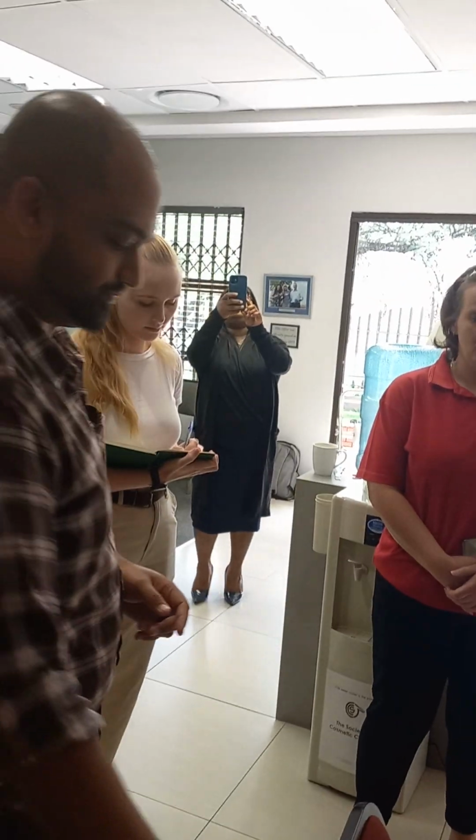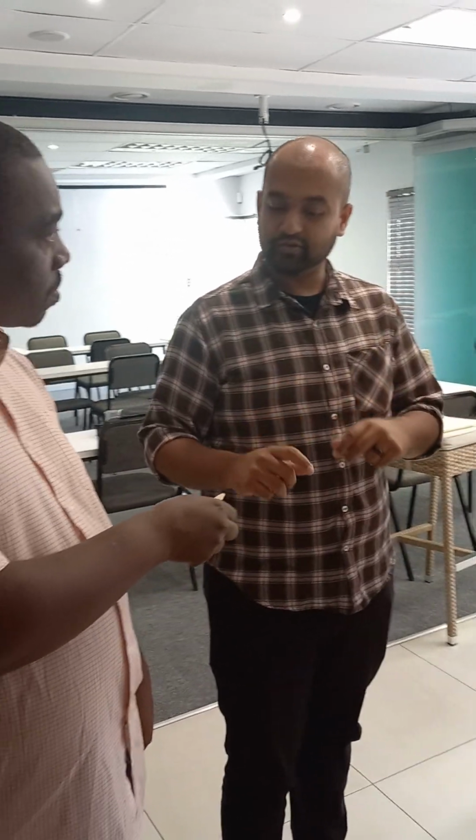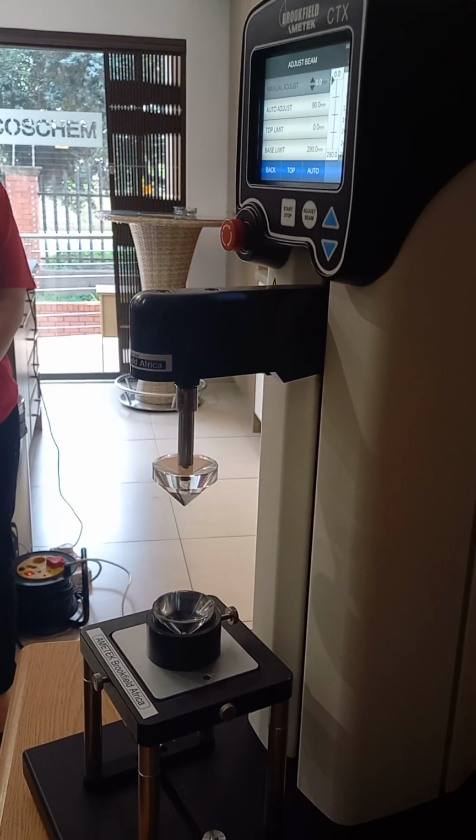For instance, if I had to tell you, break this in half, how much force will you need to apply to that stick in order for it to break? As a value, I don't know. Exactly. So in your QC and in your laboratory, you need to place a value on this, and this is where this machine comes into play.